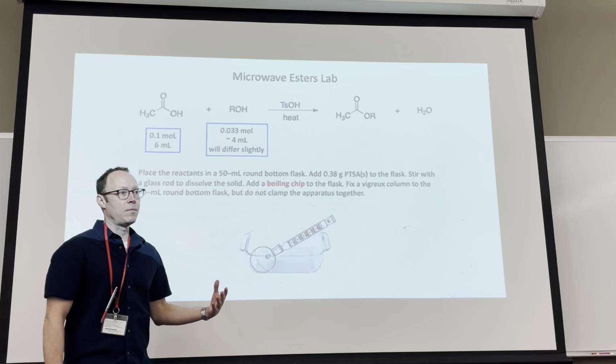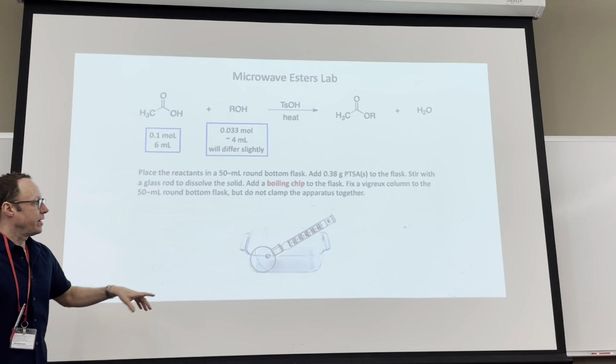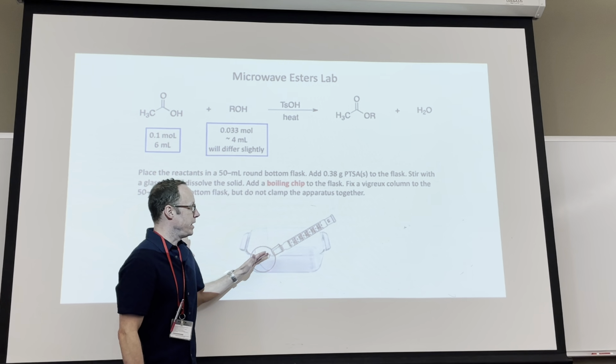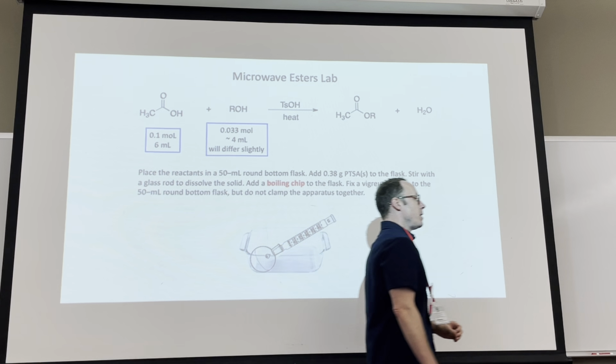We've got 2 microwaves up and running right now, and in each of them, when you open it, you'll see there's a Pyrex dish. You just set the apparatus, the glassware, in the Pyrex dish, kind of on the diagonal, and it should fit. Okay.